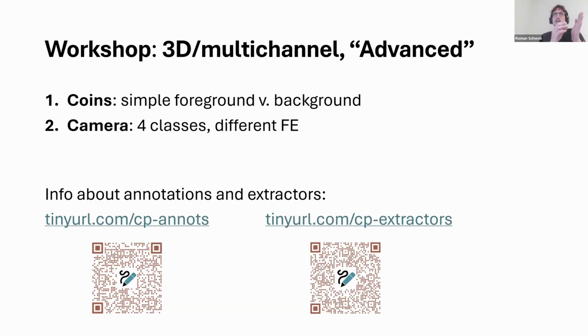neural network, analyzes with a learned filter. It basically applies a learned filter onto the pixels and then iteratively applies filters again, or kernels again. That's why it's called convolutional neural network, because it convolves those areas again and again. So this is just an iterative filtering, which can give you a much richer representation of a pixel than only applying a single filter, like for example in a handmade filter bank.